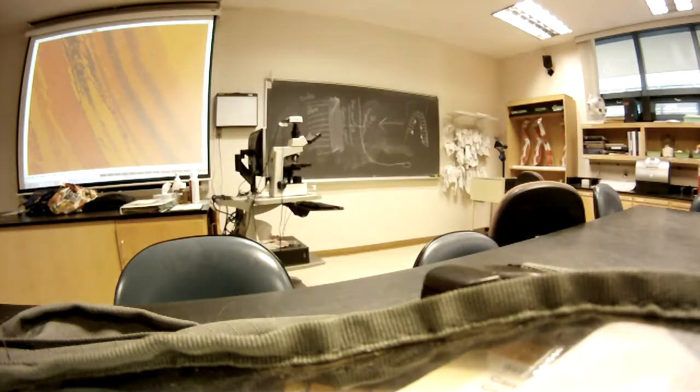You may or may not be able to see it. Can you see it? Can you turn the light on? Deborah, can you see over here? Or no? No? I'll turn on the light for a minute. You can't have everything, huh? Either remote control light. There.